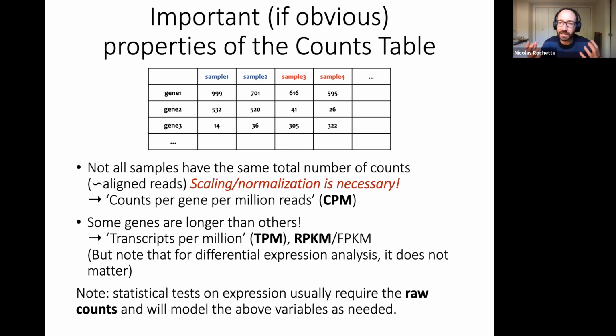So let's say that the highest expressed transcript in our cell is twice as expressed in one condition compared to the other. That can actually significantly change the scaling factor. So what TMM is trying to do, minimizing the variance, is essentially factoring out the outlier transcripts when we're determining what the scaling factor should be to get these proportions.